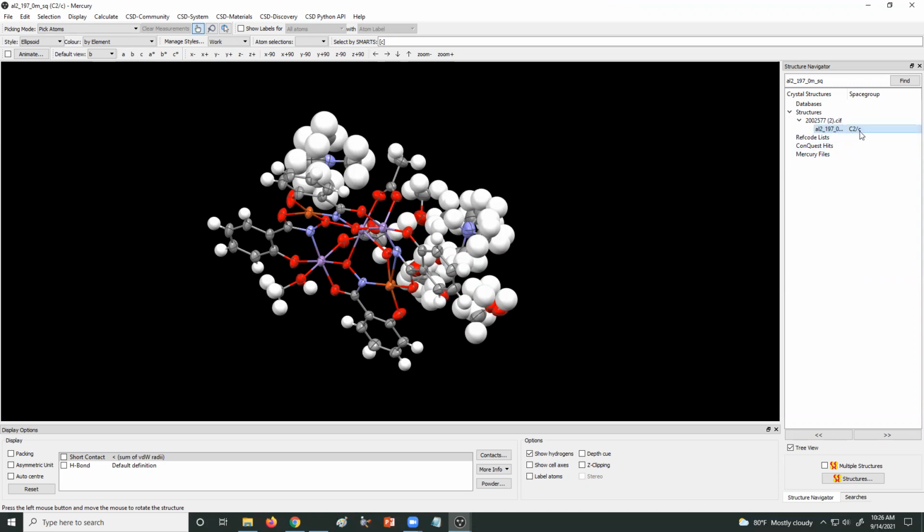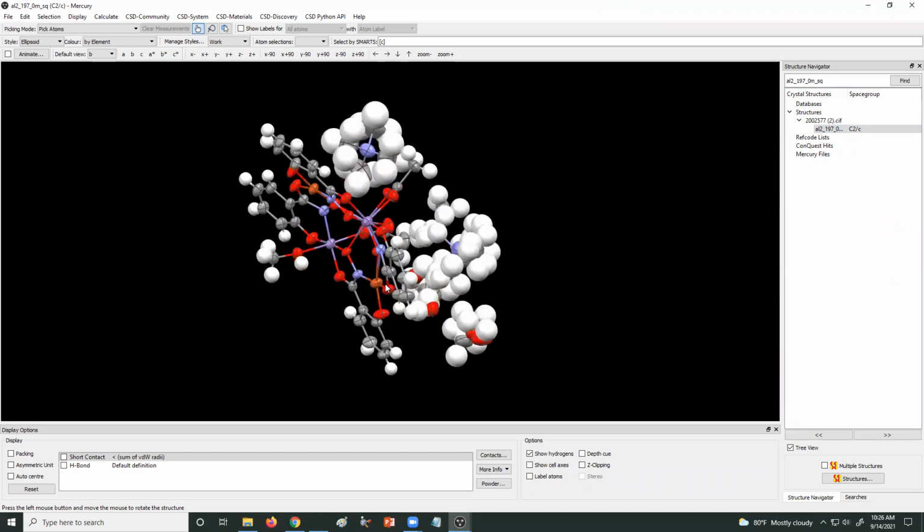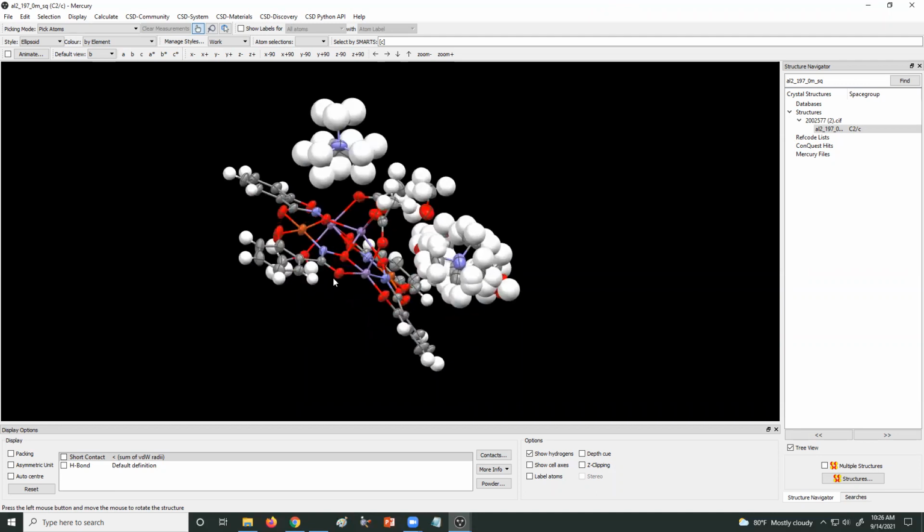This is that notation I said, the information about the unit cell. This is C2/c, okay? C is like P, like F. It's another notation that's indicating the symmetry of the unit cell. This doesn't look like a unit cell because all it is is the structure of the molecule. So once you have it up, you can, of course, save that CIF file. I would encourage you to save it to your hard drive so you can open it and do whatever you want with it.